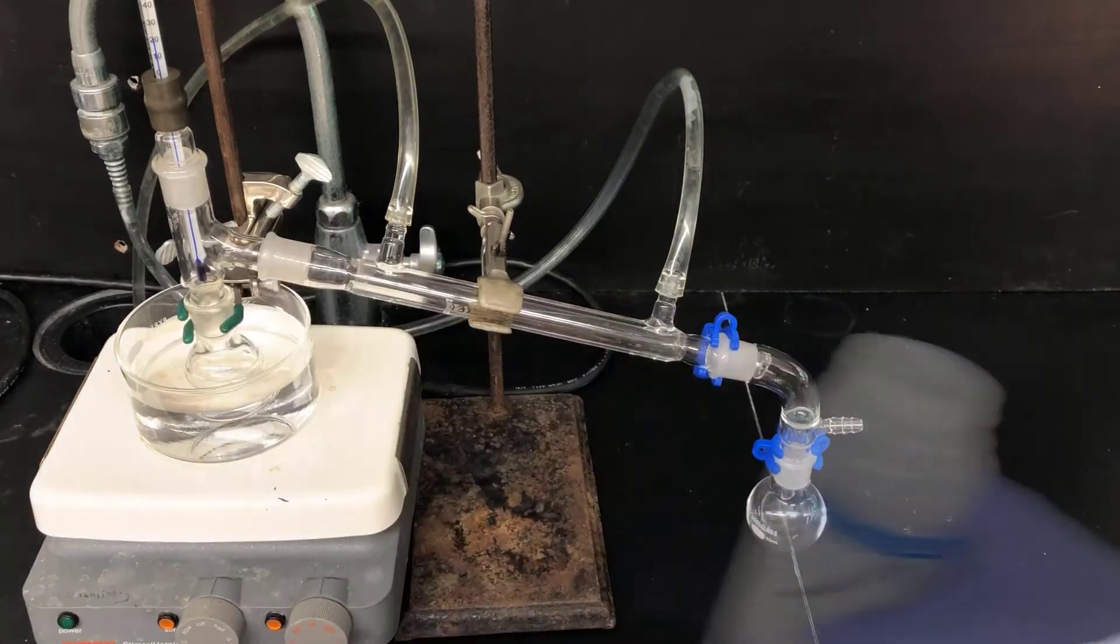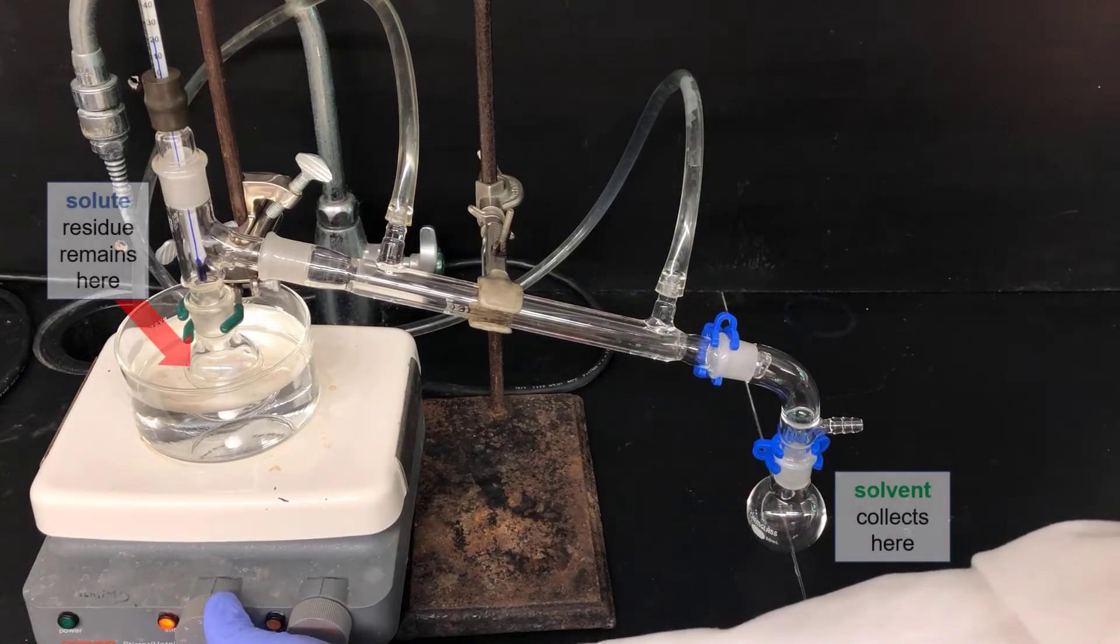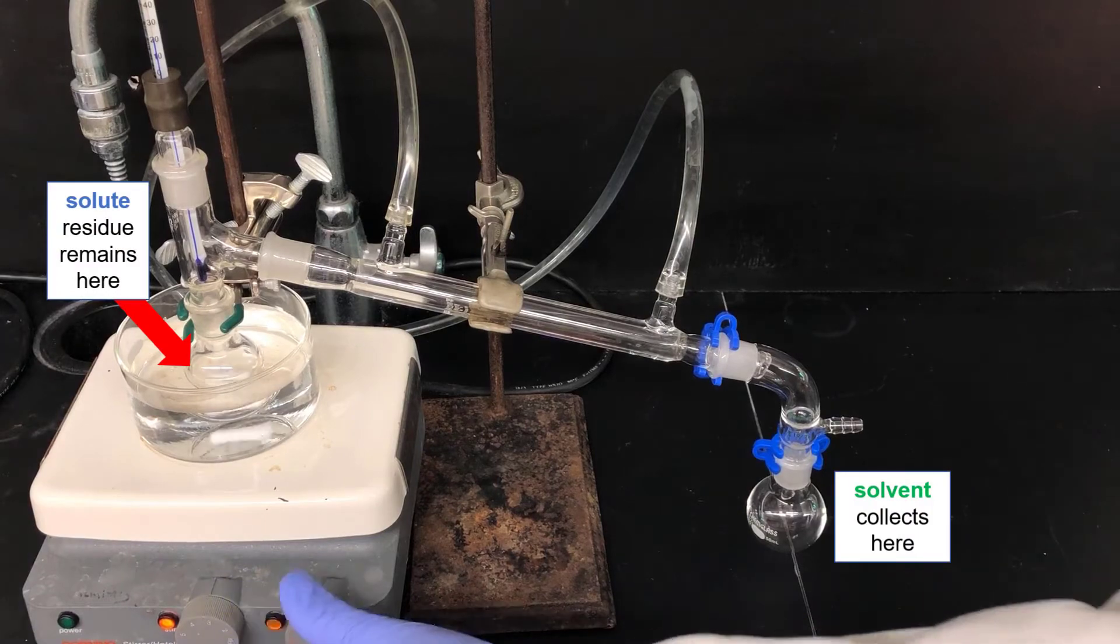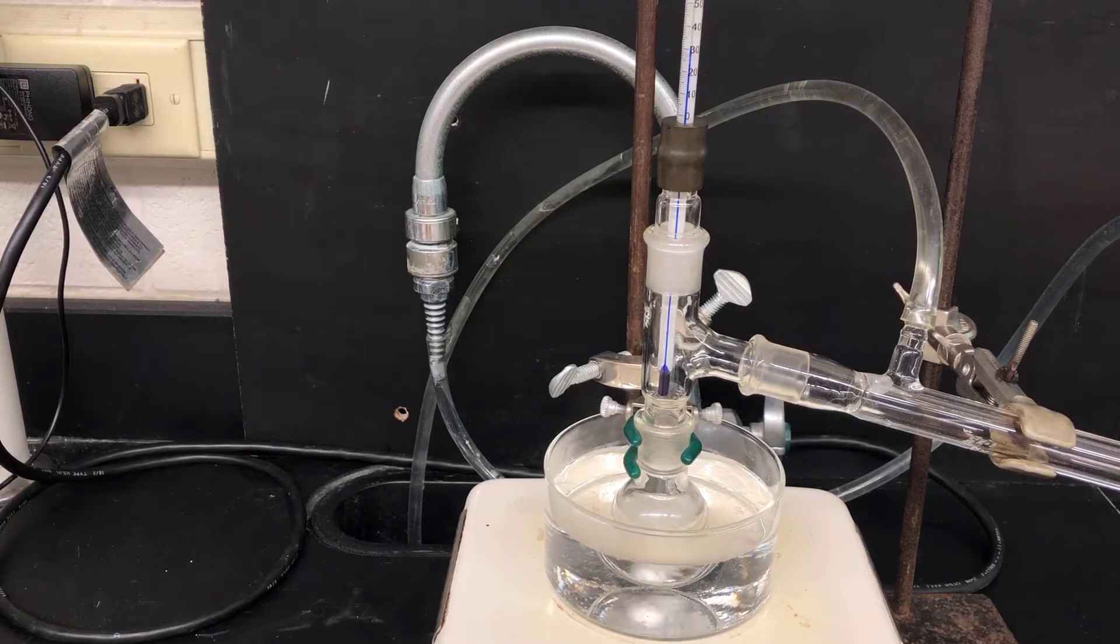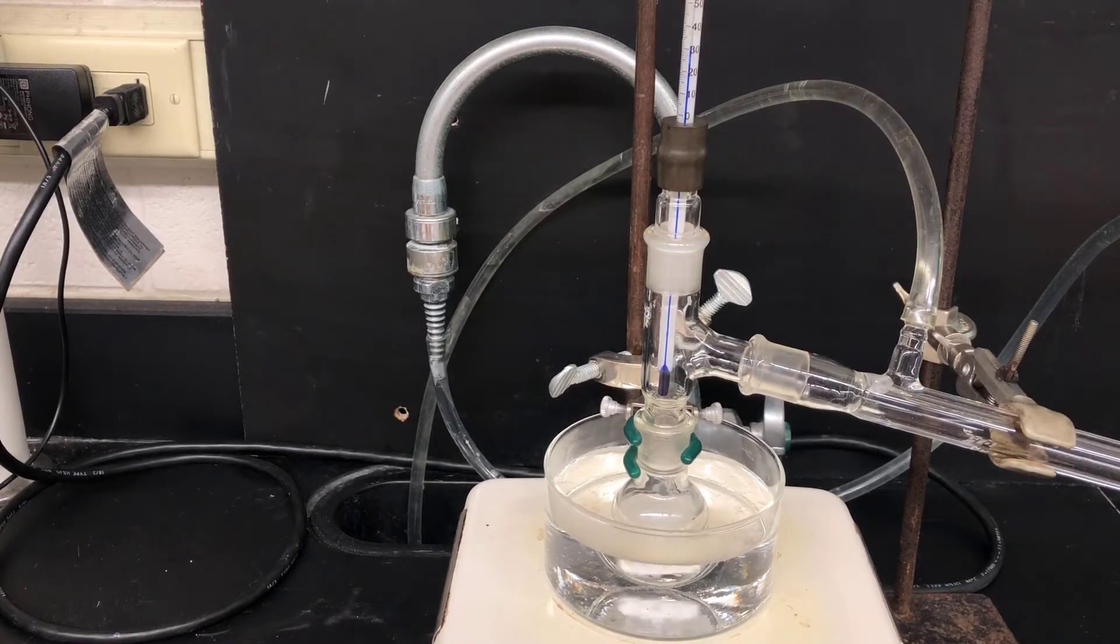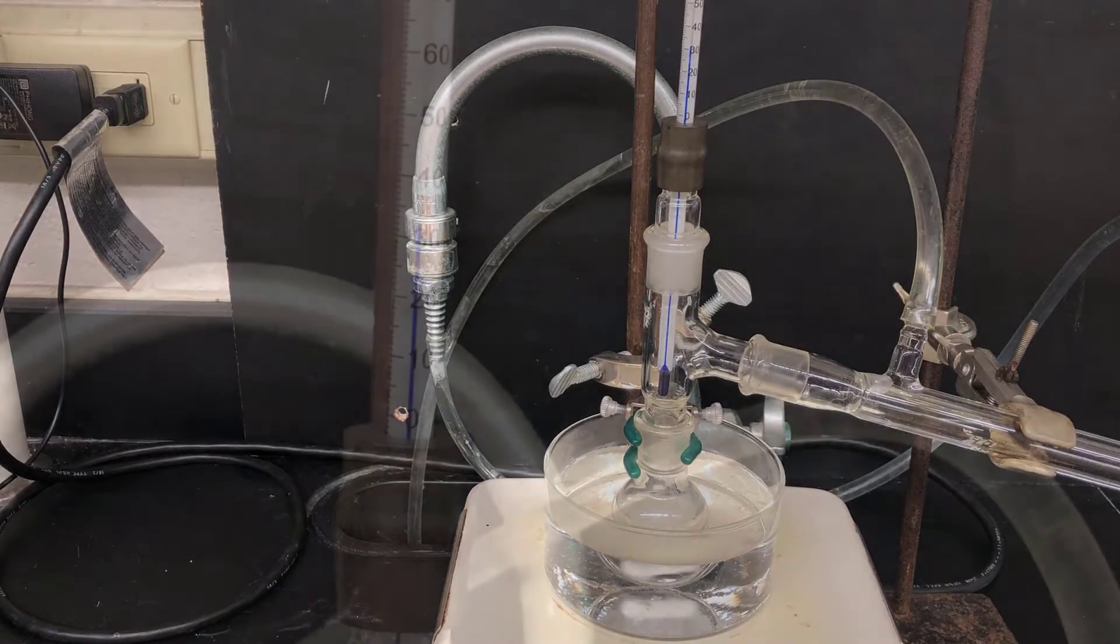So the solvent will distill over, and the solute will remain as a residue in the distillation flask on the left. Now I'm stirring the solution and heating the water bath. Now the solution is boiling, and the hot vapor has risen in the apparatus to touch the thermometer, causing the temperature on it to begin to rise. Watch this temperature carefully, because it gives you the boiling point of the unknown solvent.